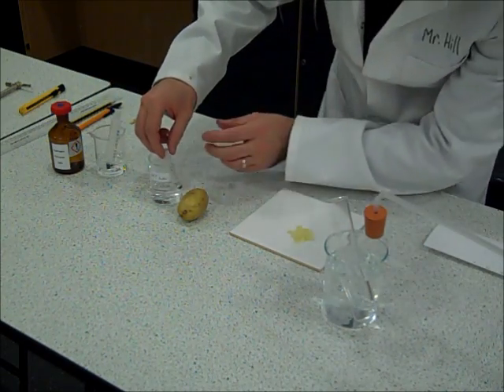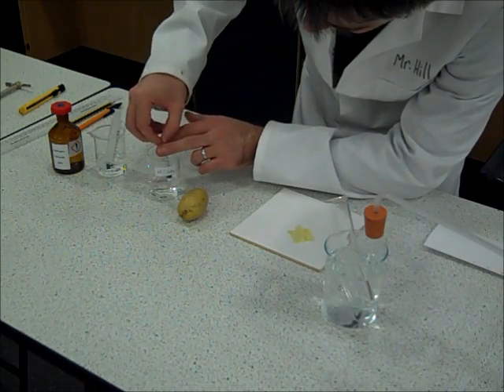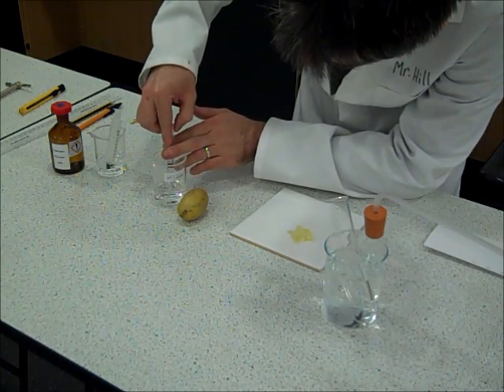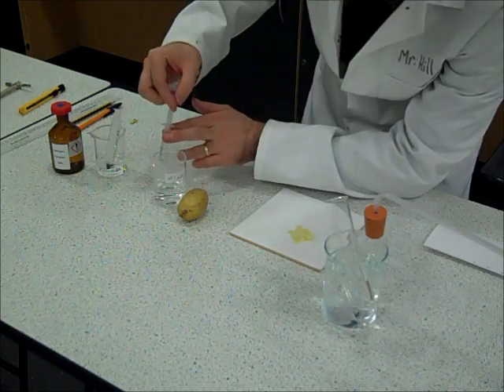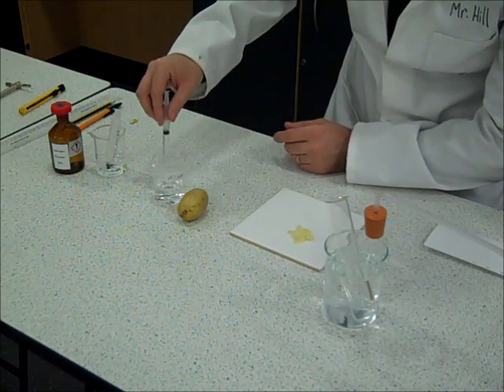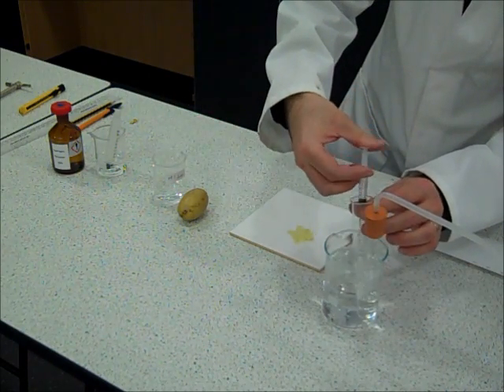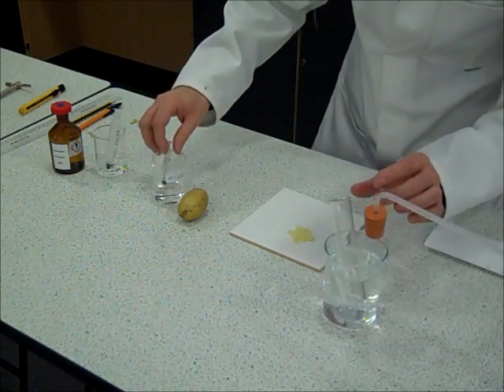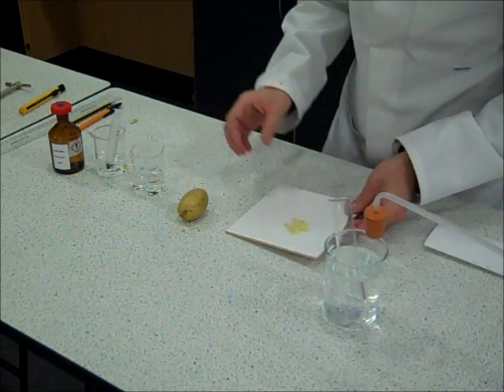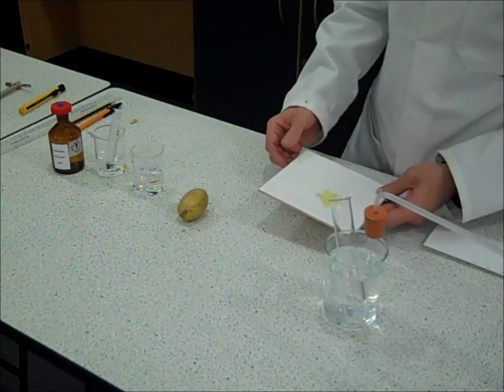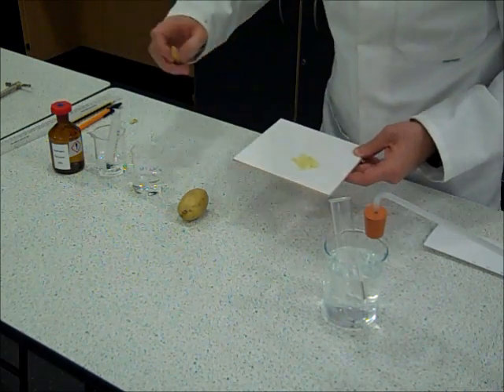I'm also going to add a pH buffer. I'm going to put 2 millilitres of that in as well to maintain the same pH throughout the reaction. And finally I'm going to put my 25 potato discs that contain catalase into the tube.